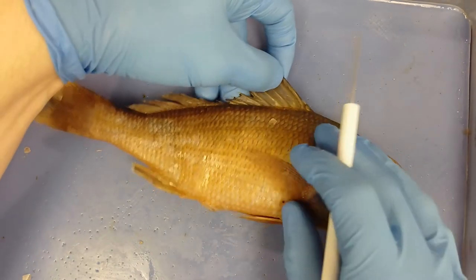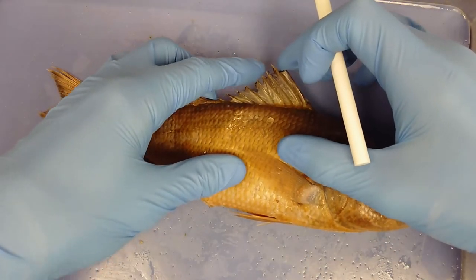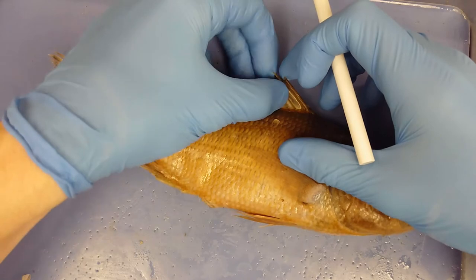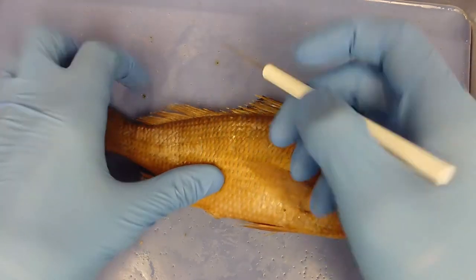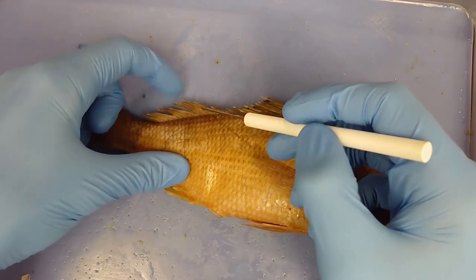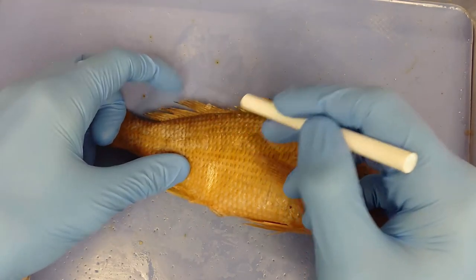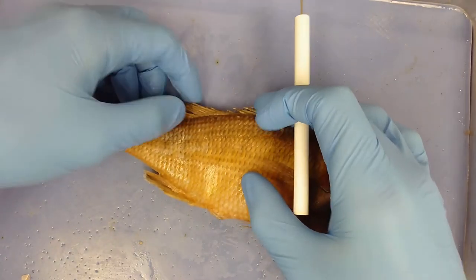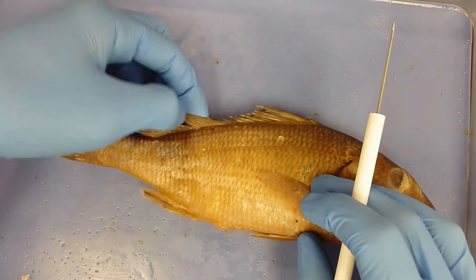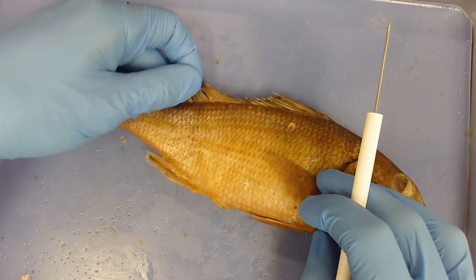We have a rayed dorsal fin and a spinous dorsal fin. The one in front is the spinous dorsal fin — it's made out of spines that are very rigid and fairly sharp. Just posterior to it is the rayed dorsal fin, which is made out of much softer, less rigid material supported by segmented cartilaginous structures.